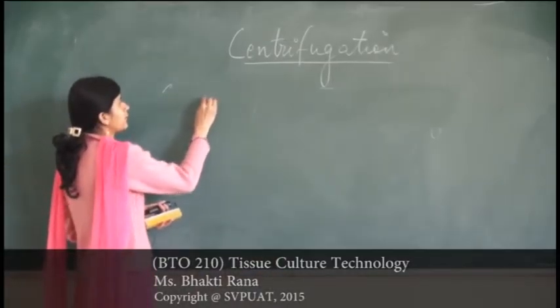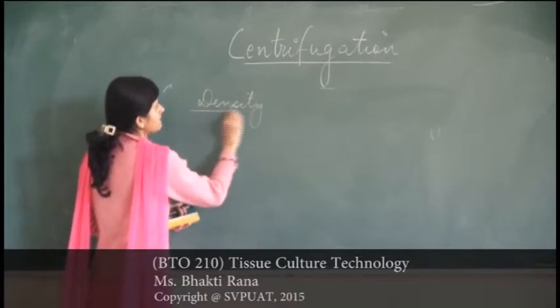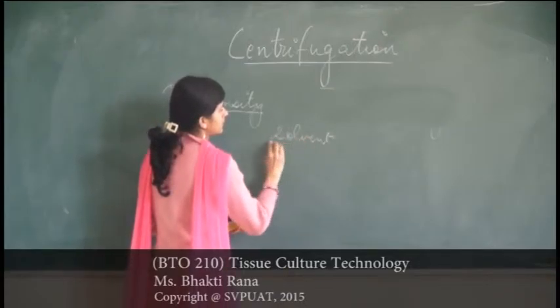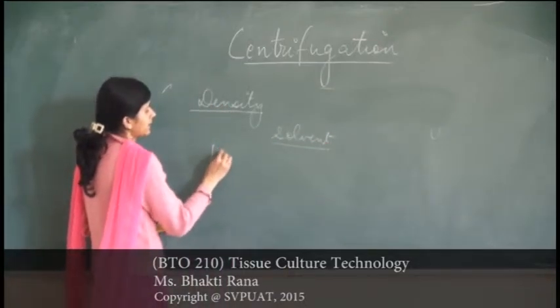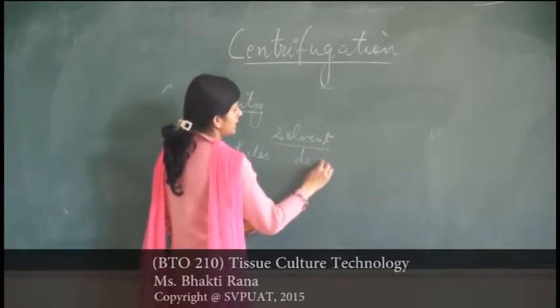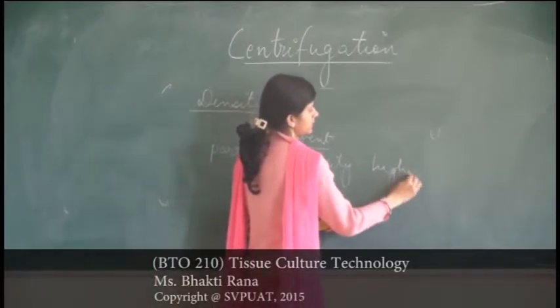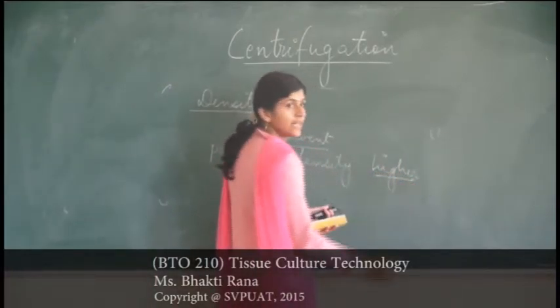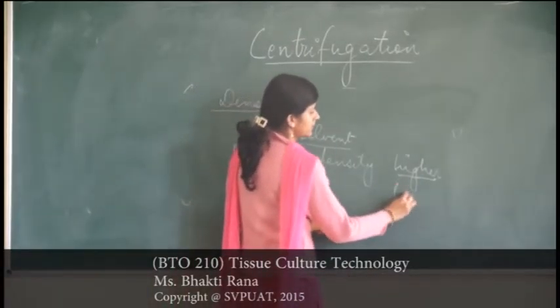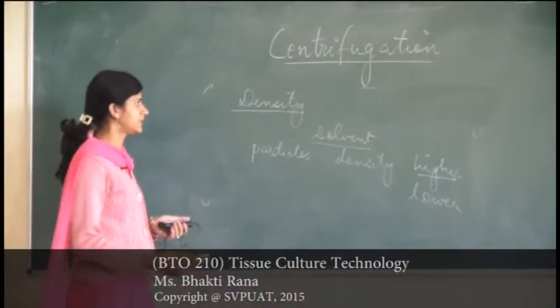The main factor involved in centrifugation is density. You have solvent and particles. Particles whose density is higher will naturally sink to the bottom, and those whose density is lower will come up, so you can separate on the basis of density.